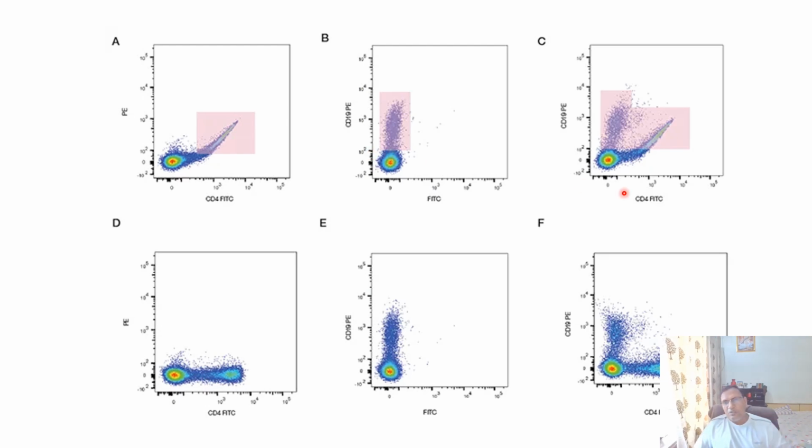When we incubate the cells with PE and FITC, in this wavelength the positive cells will overlap. You can see. So how can we do? We drag this cell population to here, on our screen, with the help of the software. And then we see the cell populations are separated when we run both FITC and PE.